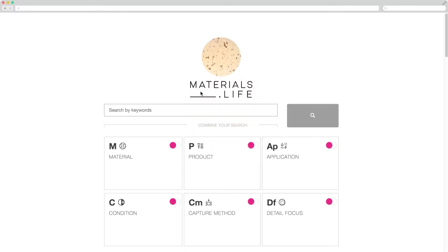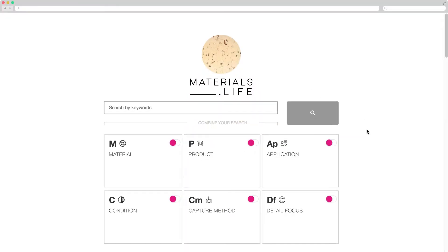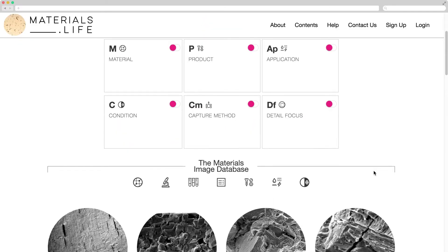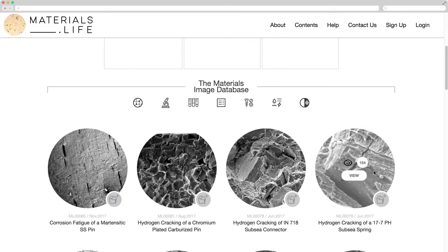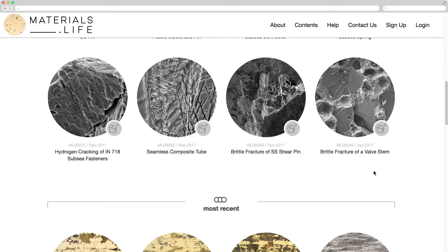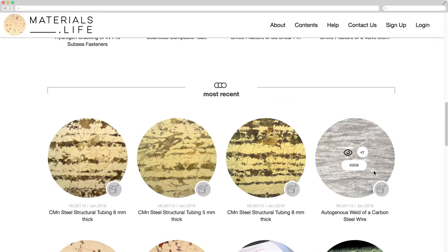Materials LifeSite is an image metallurgical database of metallic materials adopted in engineering applications. On the Home page, there are six basic categories for searching. There are also eight interesting cases selected by us and the last recently uploaded cases.